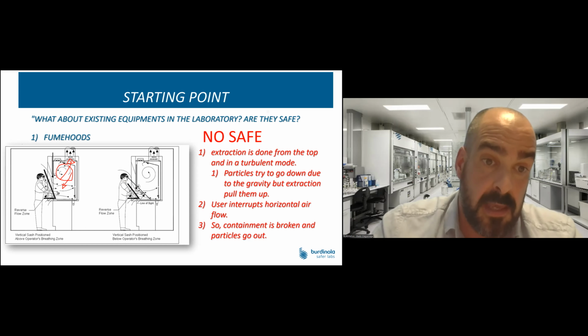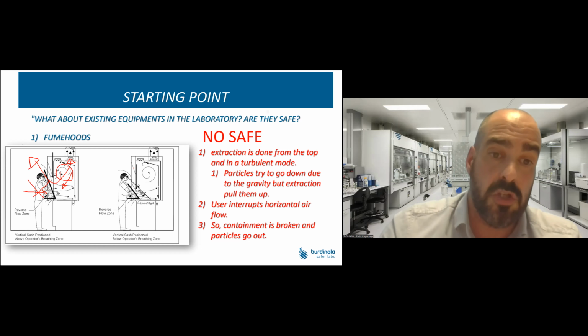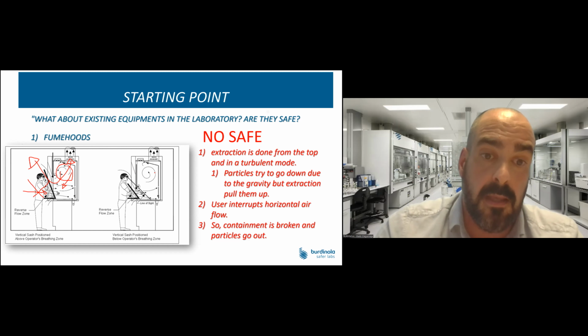The air is pulling them up, while by gravity the particles tend to go down, and they stay in a middle position. So they remain here, and in some cases the user, by cutting the flow of air here, can break the containment and the particles go out, polluting the laboratory.